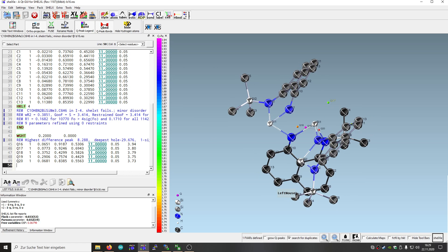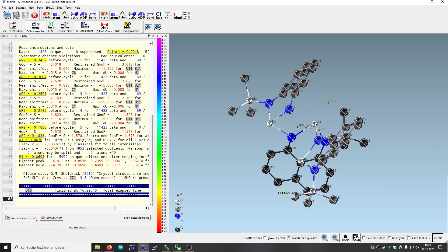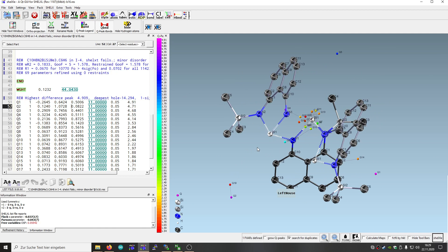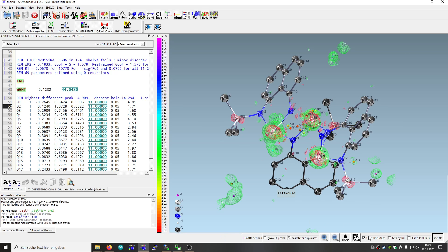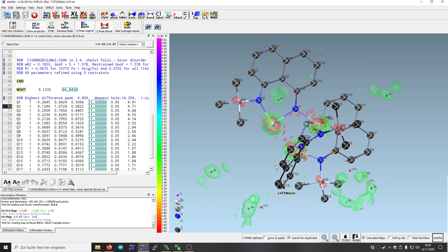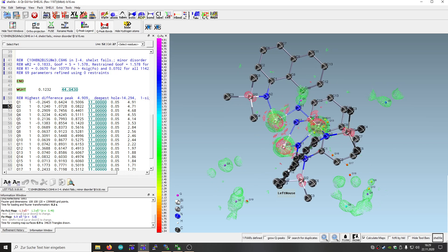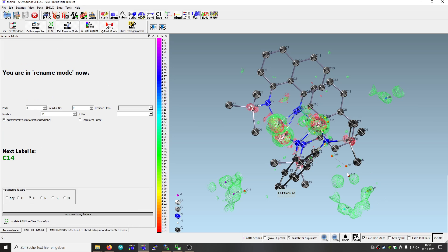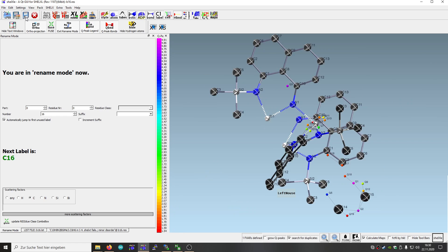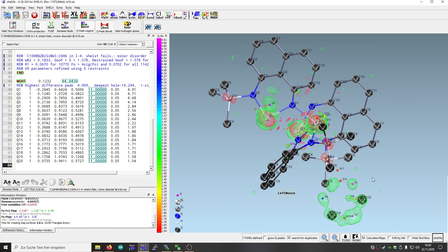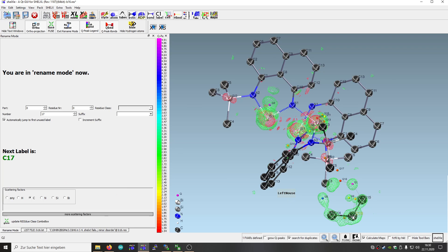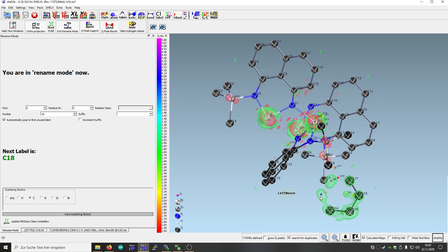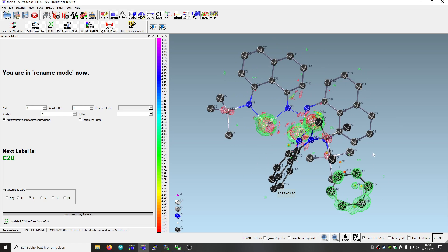Let's see what the refinement does. It seems to be rather stable. Probably there are some more carbon atoms here. Yes — we see more carbon atoms appearing.